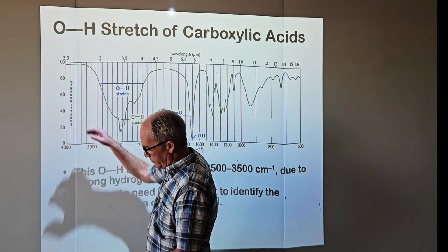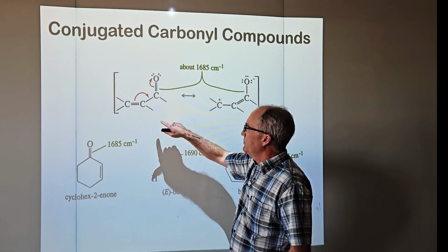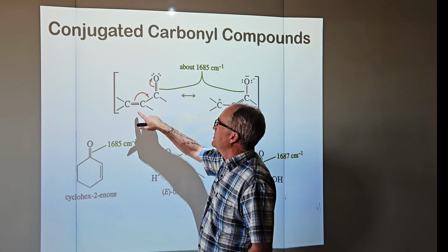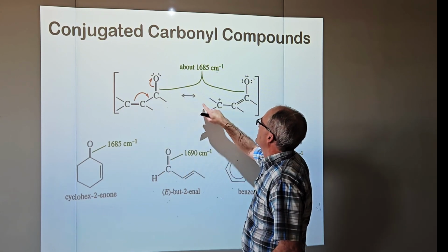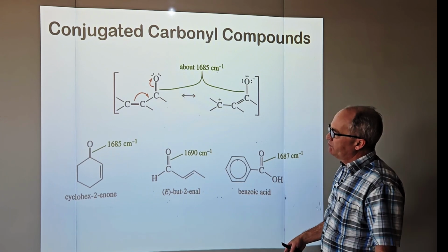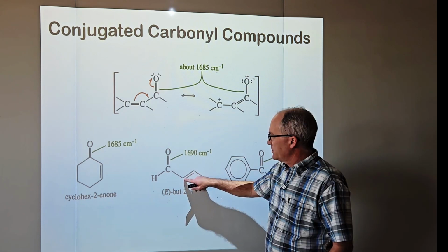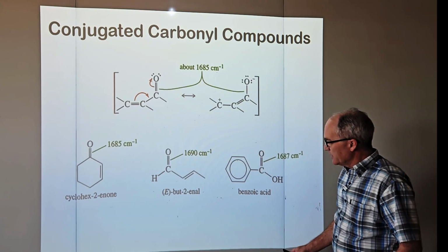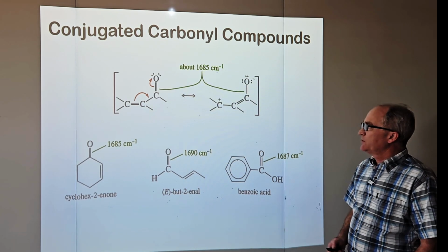Alcohol, this thing's moved over a little bit, like you correctly told me. So here's a carbonyl carbon, and here's a double bond that's adjacent. And so these are called conjugated, and they're special due to resonance. And so you see that these, instead of being at 1720, they're a little below 1700, 1685. So here's a conjugated aldehyde. I wonder if I missed a slide with words on it that said conjugation shifts the stretching frequency a little bit over to the right.